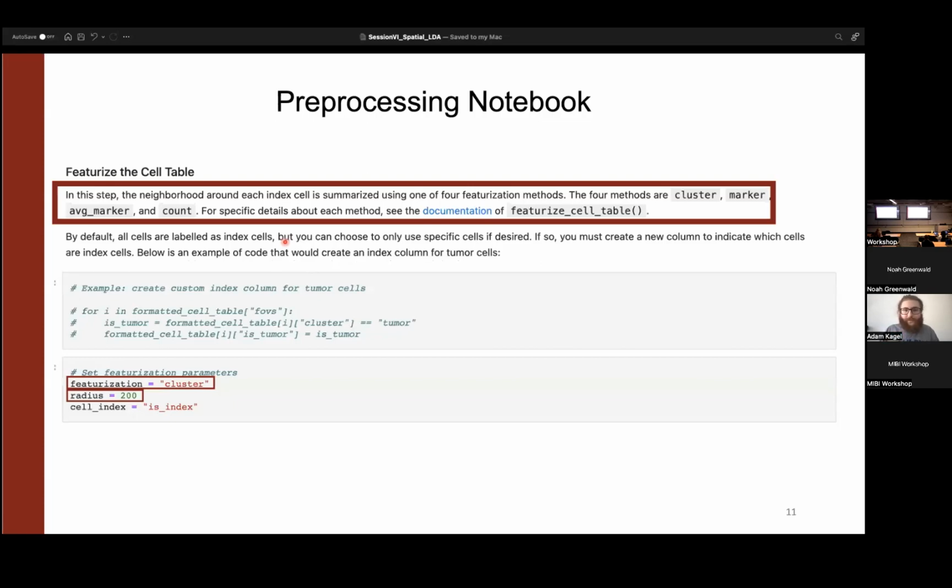In the pre-processing notebook, by the way, I'm skipping over the data path setup because once you're this far into ARC analysis, you're tired of data paths 100%. You know how to do it.